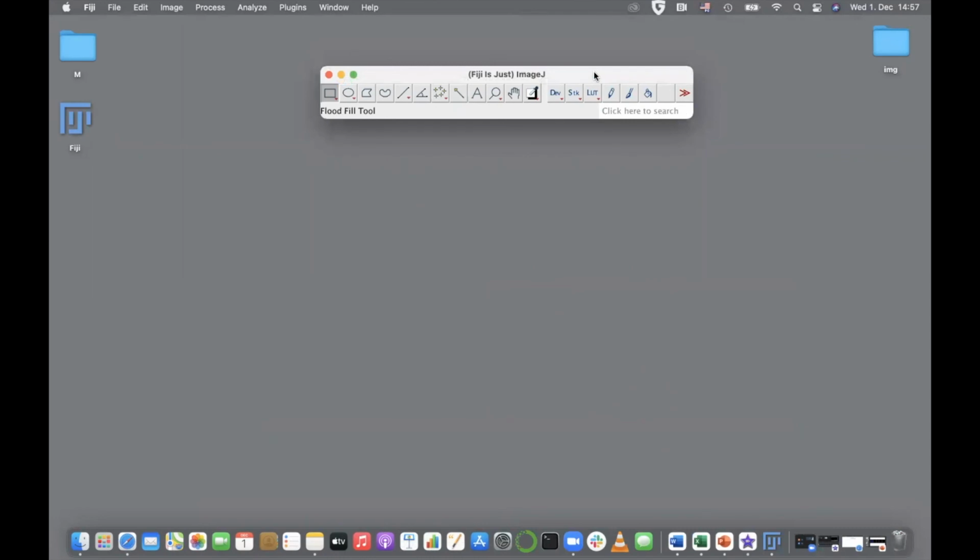Okay, now that we know how CiliaQ Preparator works, next time we will talk about how to edit the images that are outputs from the CiliaQ Preparator and how to deal with those edited files.